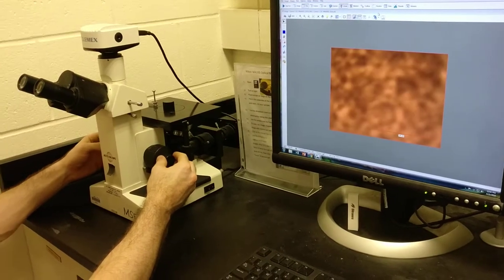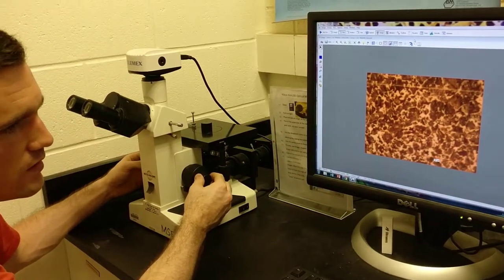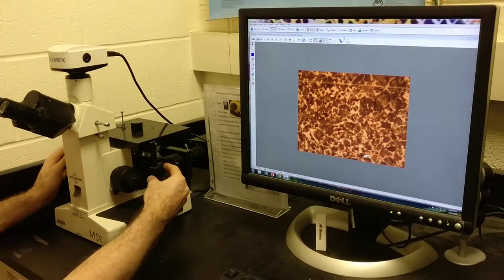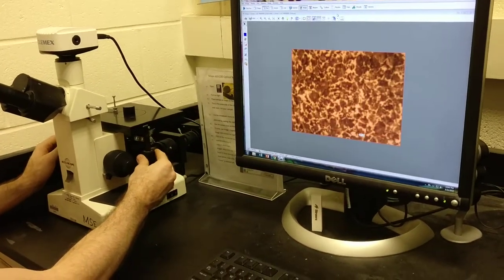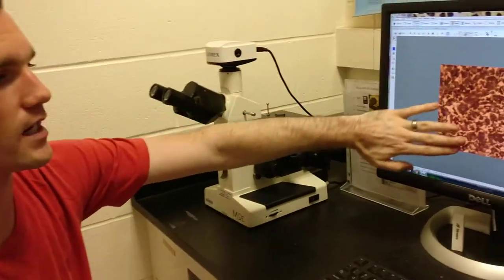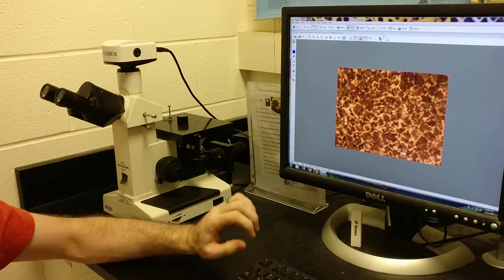You'll notice as you get to higher and higher magnifications, your depth of field decreases, so you have a very slim range of focus. If your sample is tilted at this point, you'll notice the focus going from one side of the image to the other, and maybe your sample is not perfectly flat.